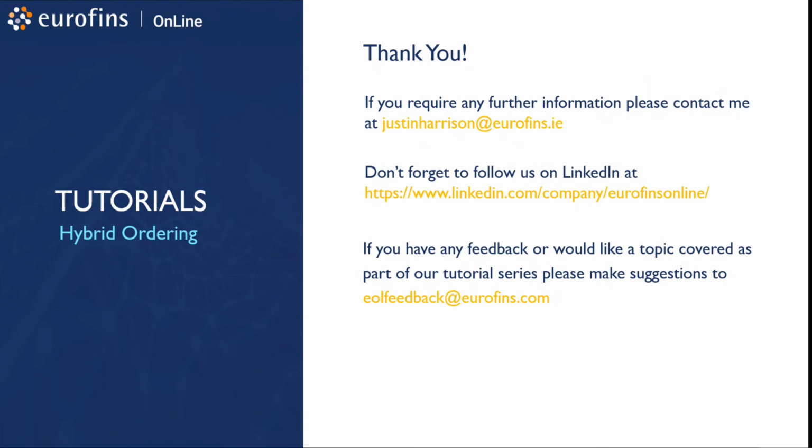So that's it. I think we've clearly illustrated during this tutorial the two use cases of a split workflow and also a sample taking only workflow. I think we've also illustrated how well EOL Mobile and EOL Web interact with each other and are integrated. And this is one of many use cases that we will be featuring throughout the course of these tutorials. EOL Web is a great product, and it really will be able to supplement your ordering experience, provide greater flexibility, and we hope that you enjoy using it.